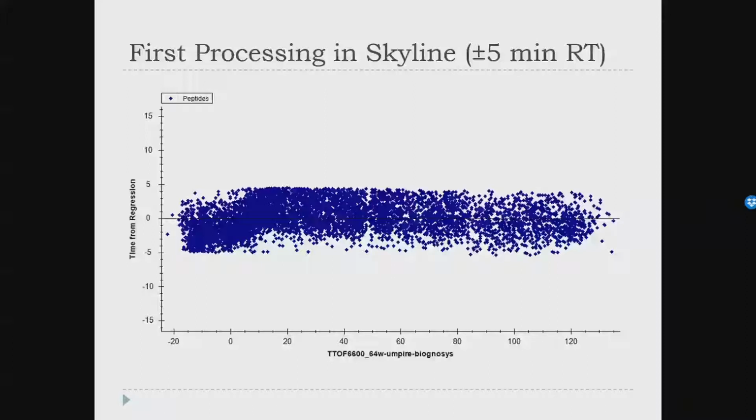Yeah, there's a difference in density, which just tells us that maybe we extracted more peptides in this range. So there's some density of things that we're querying, and they're more dense here. What are the extremes of the points? The gradient is not that stable, or well, why do you say that?